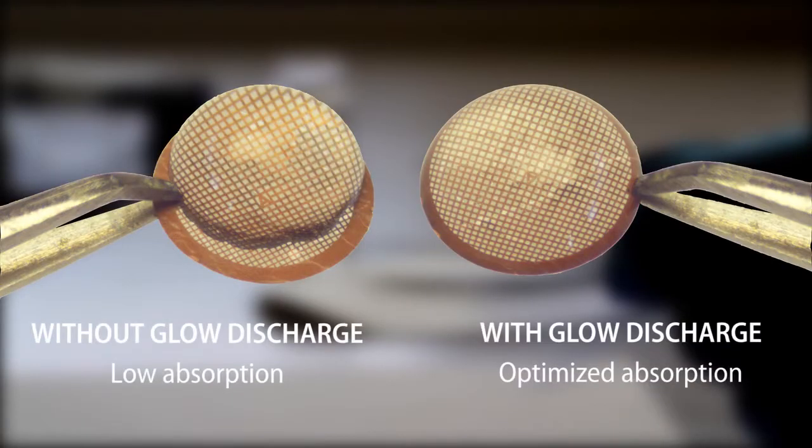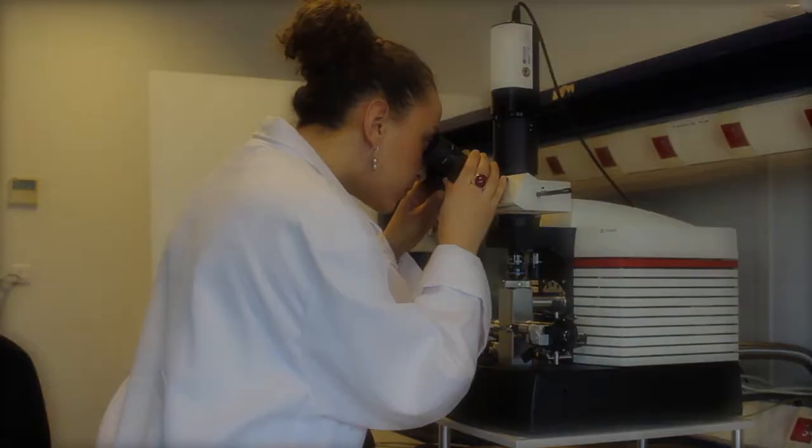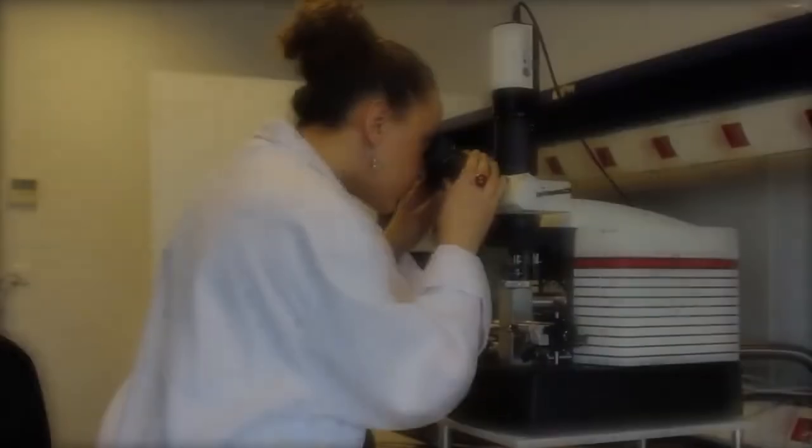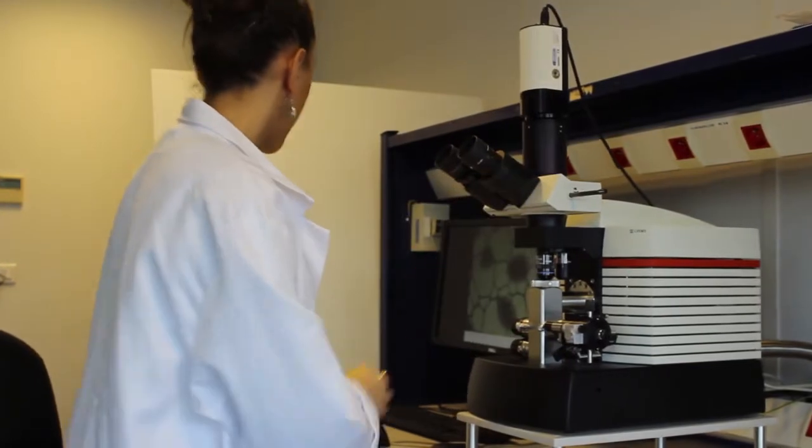Using the ELMO system improves significantly the adsorption of your solution to spread. ELMO is the ideal tool for the preparation of your TEM support films or grids in order to enhance the quality of your observations with electron microscope.